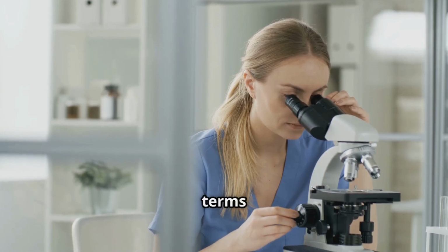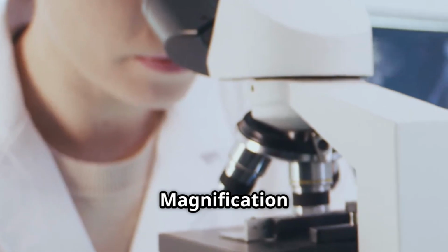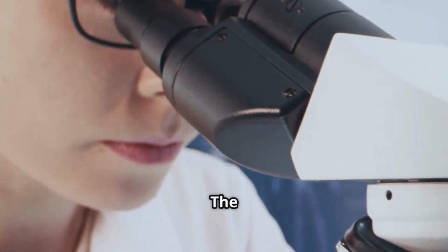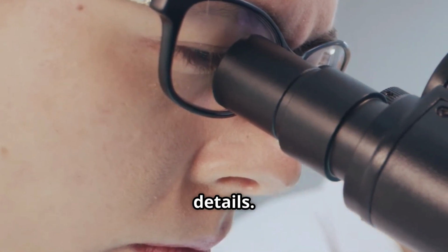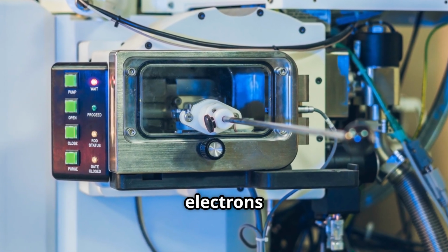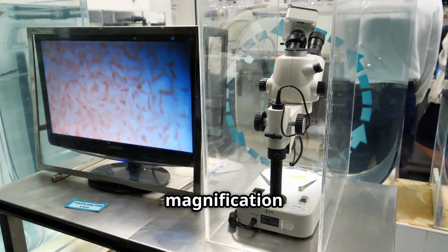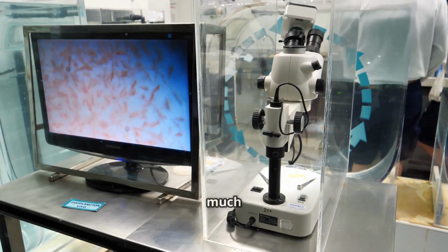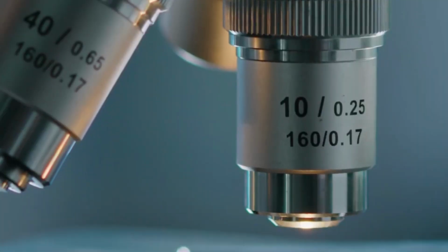Let's look at some common terms in microscopy. Magnification: the process of enlarging an object to examine its details. This is done using lenses that bend light or electrons to enlarge the image. In other words, the magnification of an image is simply how much we have enlarged the object in order to observe it.